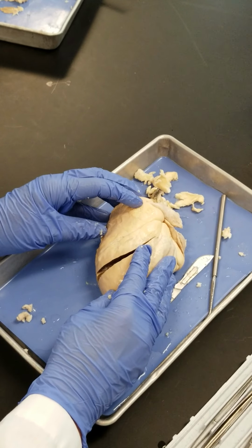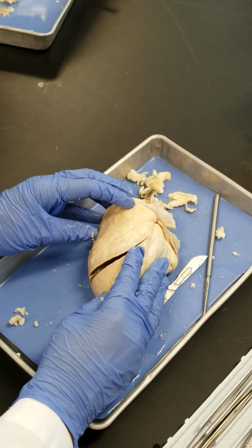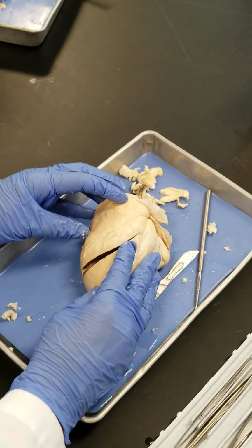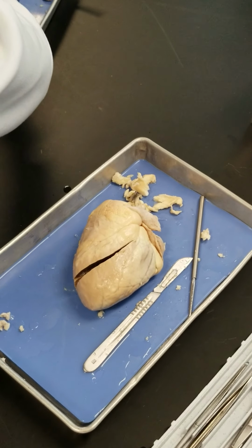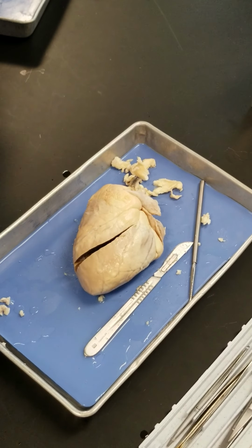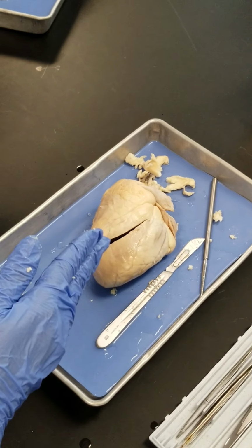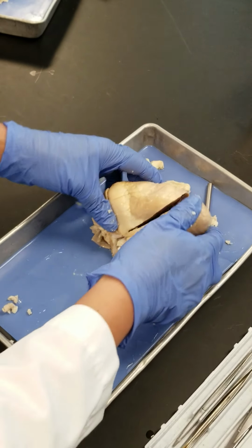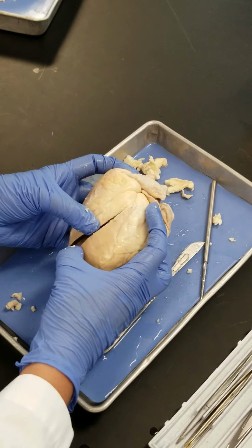So you finished? Everybody has done? Just go straight over here. Is this a good place to cut it? That's okay, nothing is wrong. You can do it anyway, right? Just continue over there the same way, parallel to the anterior ones. Go away, like this. You don't have to turn it around and continue with the posterior interventricular sulcus. Just go like this. I had to work hard with all this fat on.